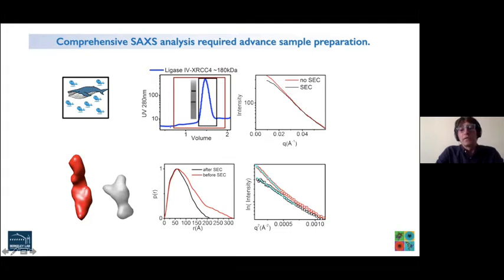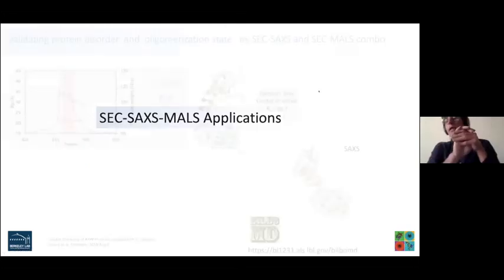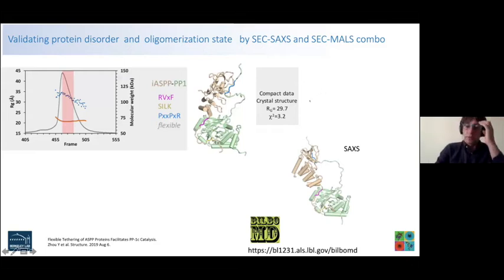In this case, you don't see it in your lab's size exclusion column, where there is a super clean peak, one peak. But even a little amount of aggregation can really screw up your signal and distract, like a whale among small fish. Okay, so I would say the application helps us to really understand what we're doing here.